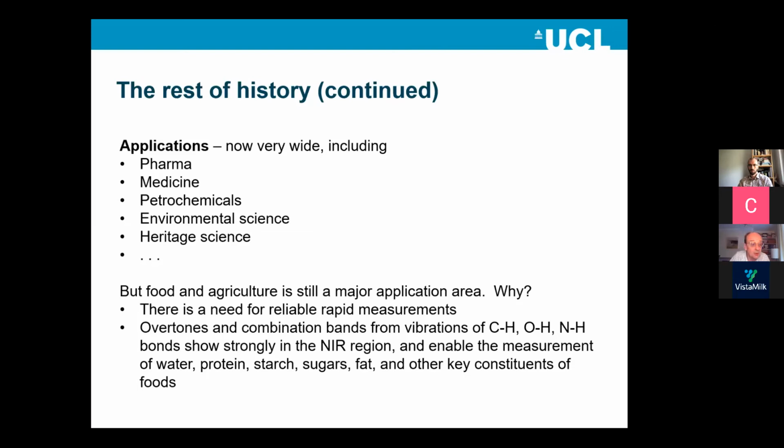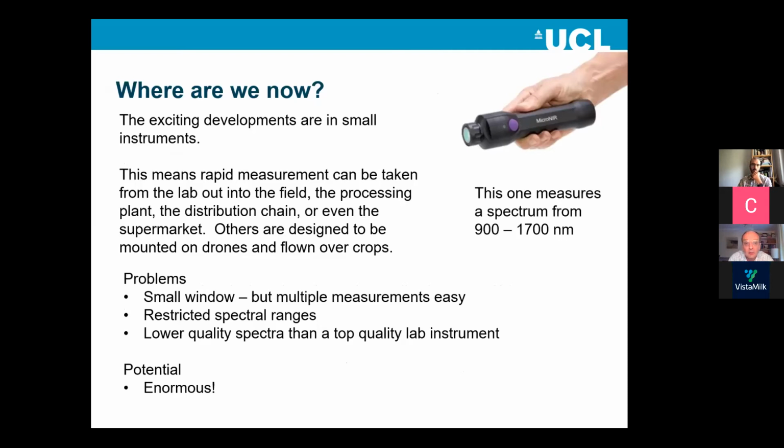So where are we now? I said I'd say a bit more about portable instruments. So there's a lot going on in this area. There are a lot of new instruments coming on the market all the time. They're getting smaller. They're not always getting better. They're being marketed quite aggressively in some cases.